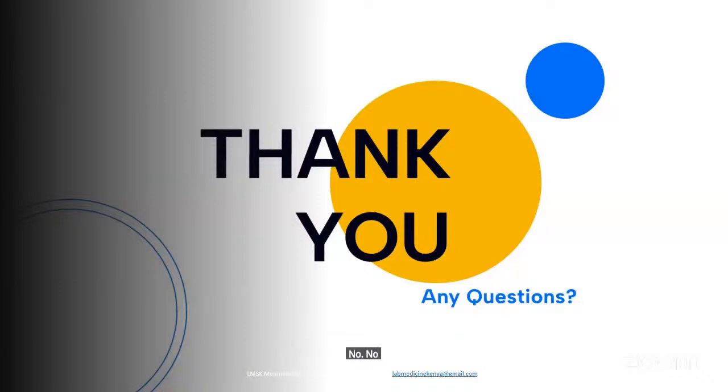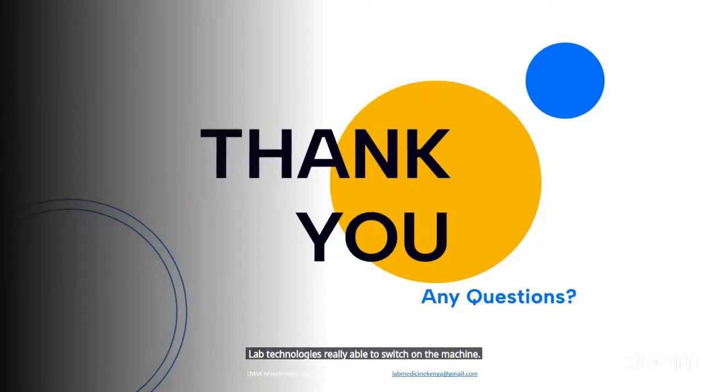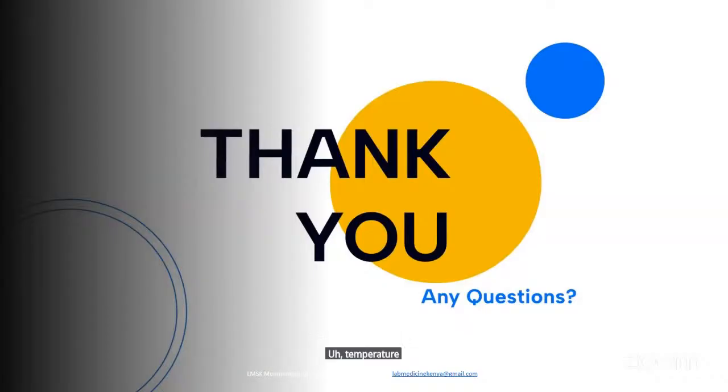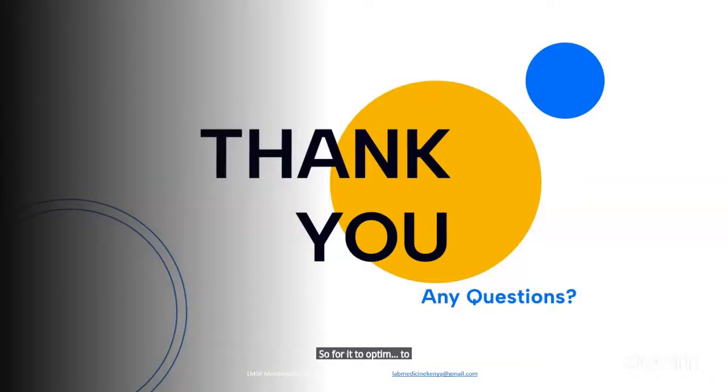No, I said first the theater team will have to communicate in advance to the lab team, and the lab technologists will be able to switch on the machine so that it can acquire the optimum temperature for sectioning a frozen section. And the optimum temperature, I said, is between -20 to -30. For it to get to that temperature, it has to go slowly, it has to acclimatize slowly.